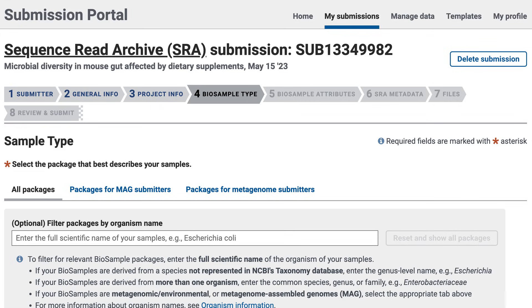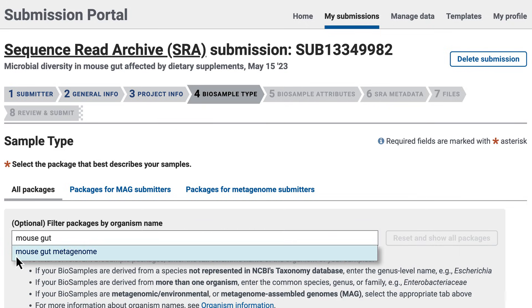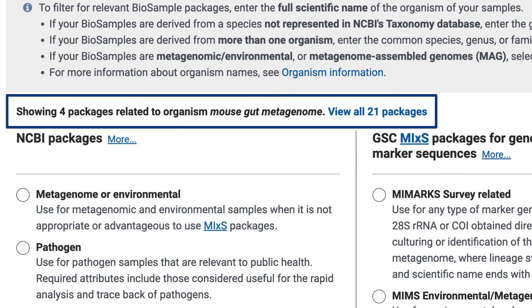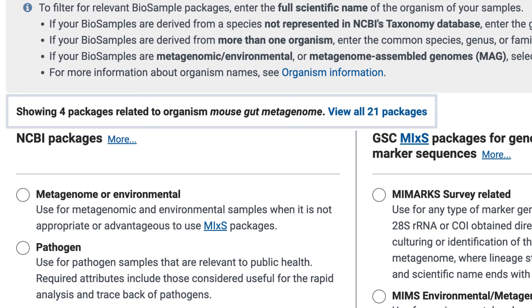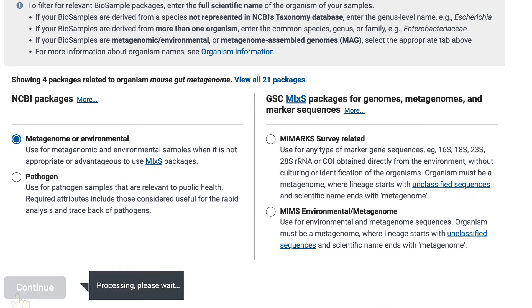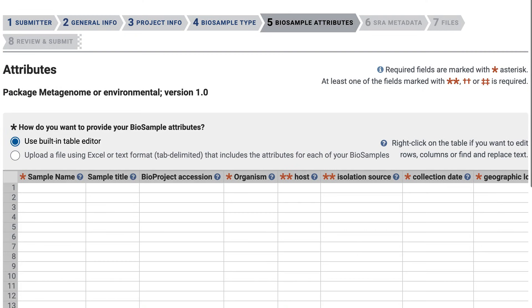Now I can start entering biosample information. Although optional, I'm going to filter packages by selecting Mouse Gut Metagenome. Filtering is helpful because it gives you the most relevant set of packages, and choosing the right package helps you in the next step when you provide attributes for your biological samples. I'll choose the Metagenome or Environmental package, and I can now enter my biosample attributes. I'm going to choose the built-in table editor, but you could download the biosample package spreadsheet, fill it out, then come back here to upload the file.